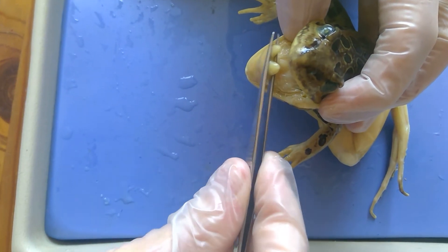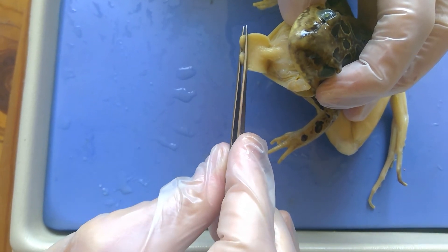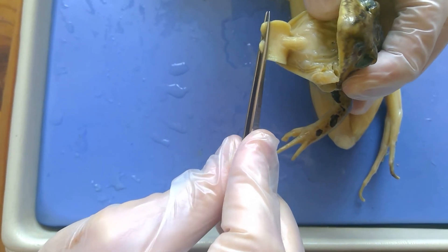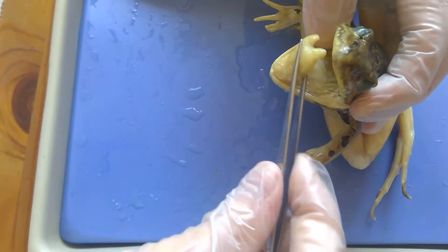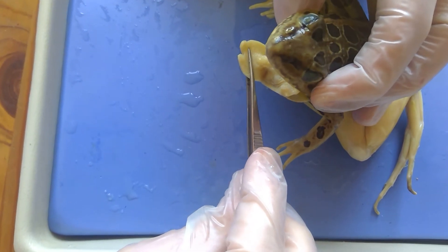And actually these little fingers right here actually grab onto the food and then bring it back into its mouth. So that's how it's using its tongue. It's whipping down and back.